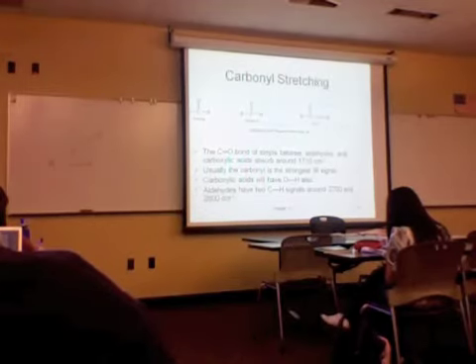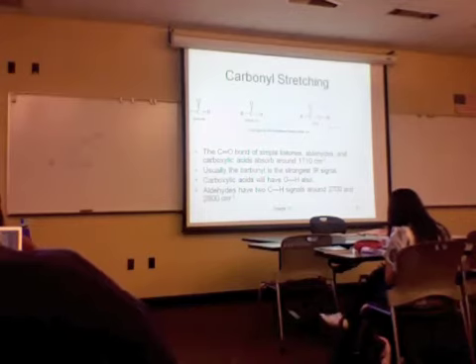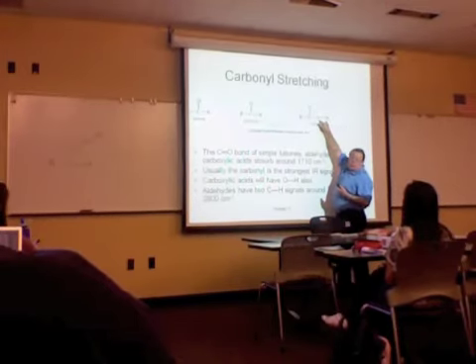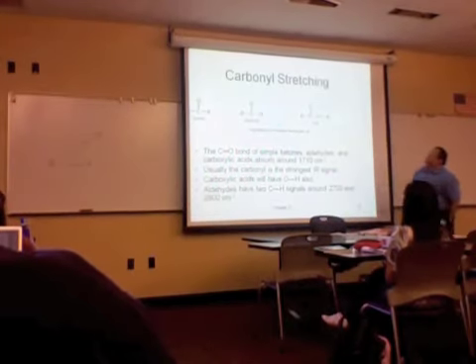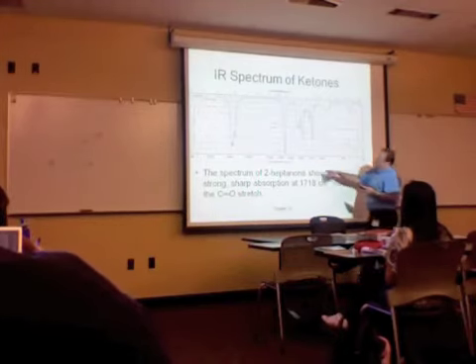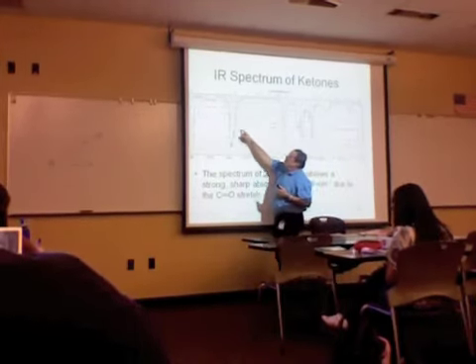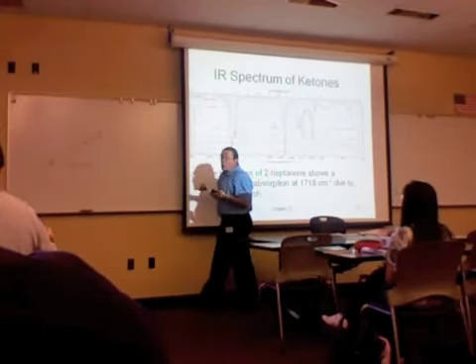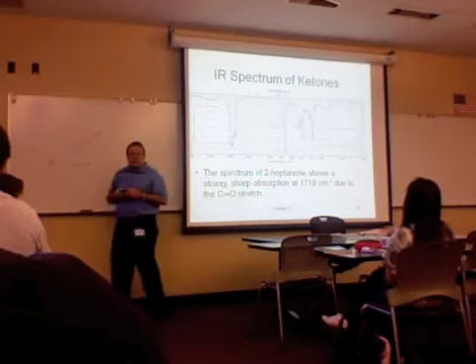In general, the alcohol, or the carboxylic acid alcohol group, has a tendency to hydrogen bond even more. We'll look at this as well in a moment. So these are usually real easy to identify. Here's the ketone. Here's my carbonyl stretch. And we don't see anything at 2700 and 2800. We don't see anything up here associated with an OH stretch that we might see with a carboxylic acid.